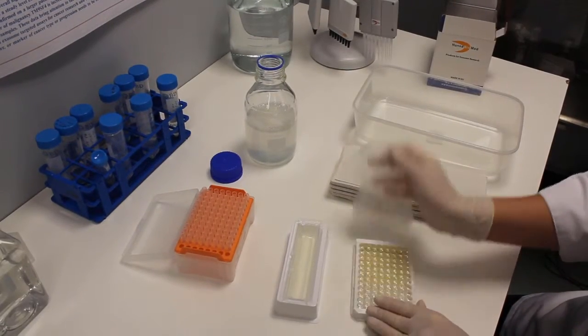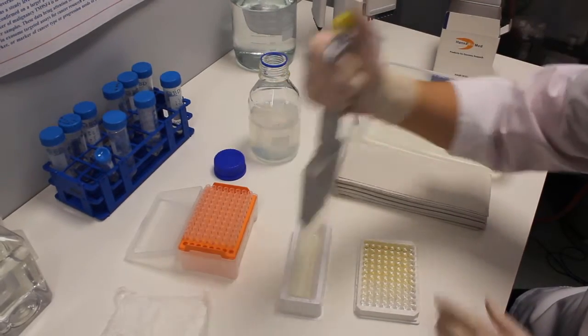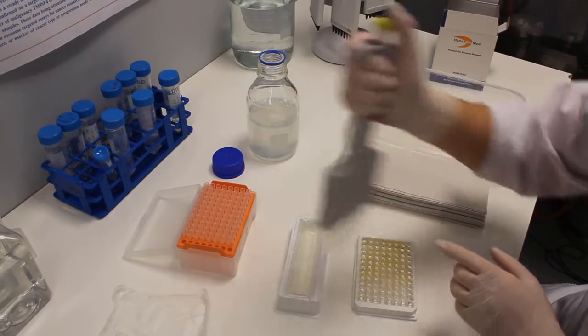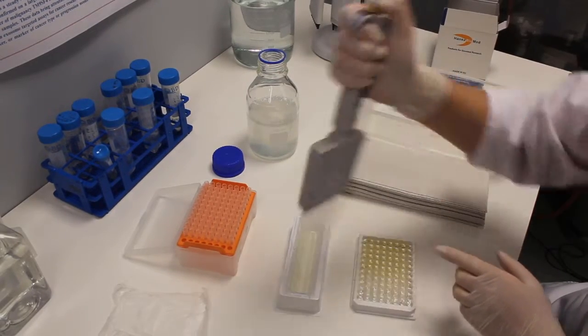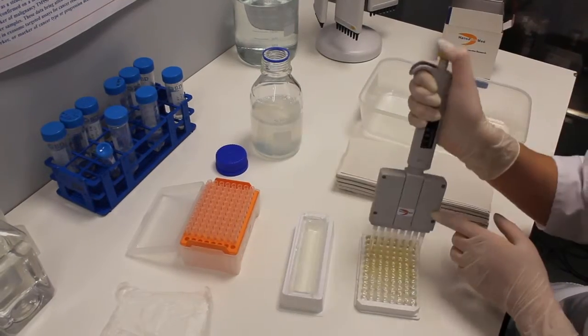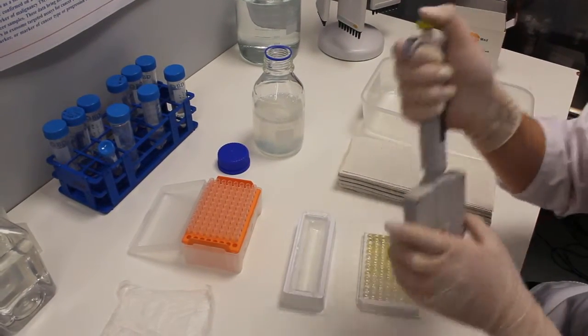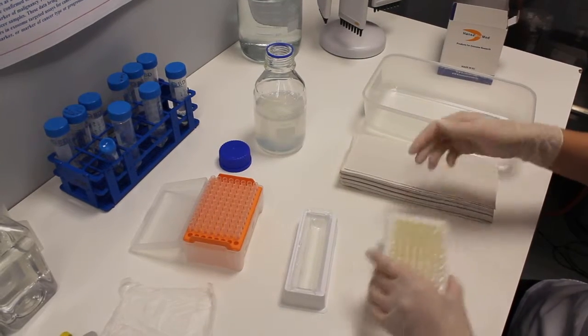First, add 200 microliters of washing buffer per well and then discard plate contents.